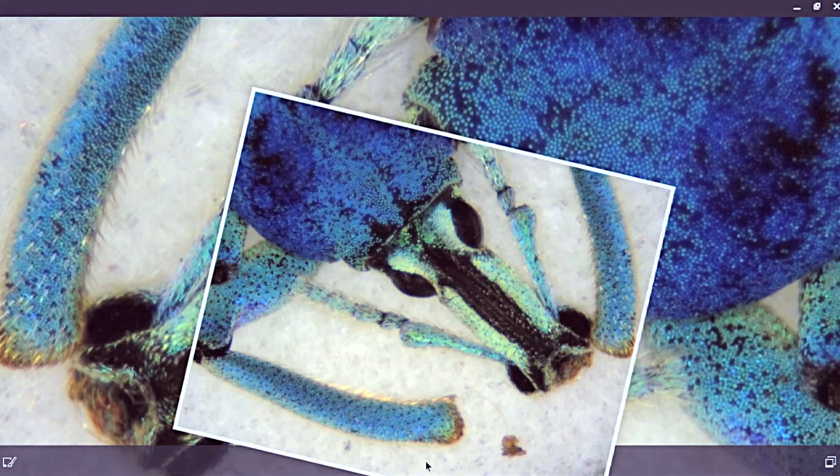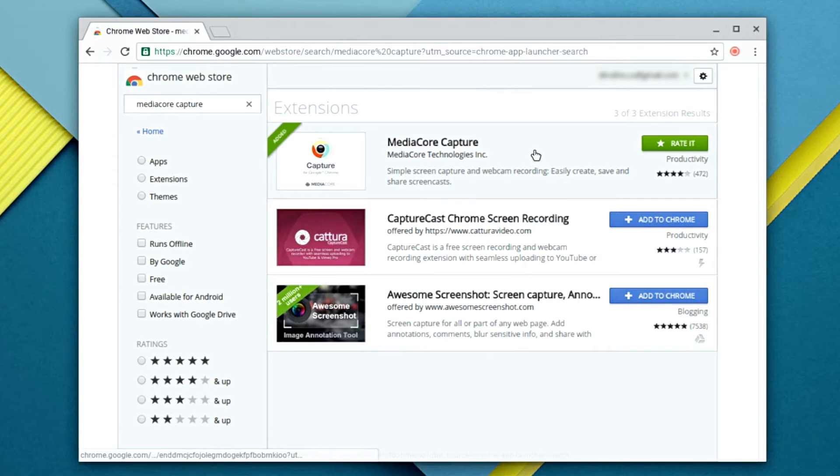This camera application allows users to have a live view and also capture images. Capturing video requires additional web apps, which can be found in the Chrome Web Store. In our testing, we've used the MediaCore Capture app for video capture easily.